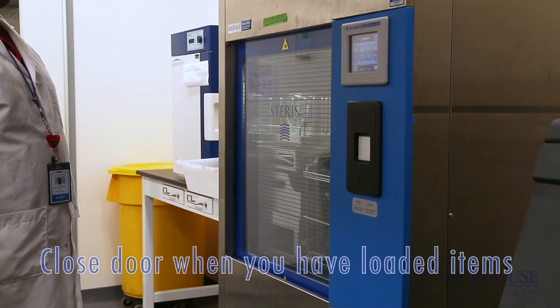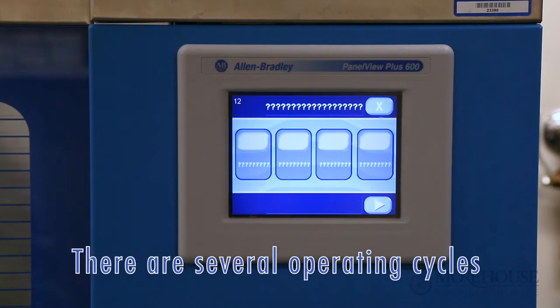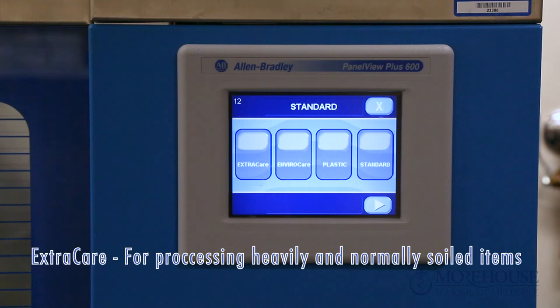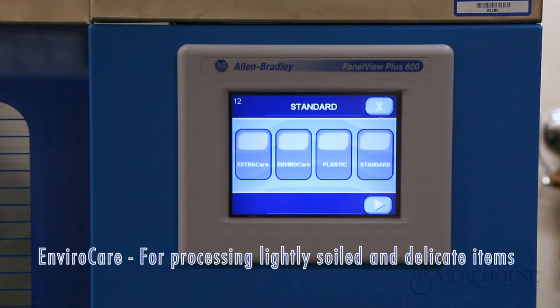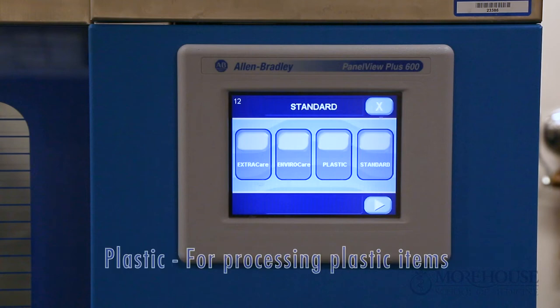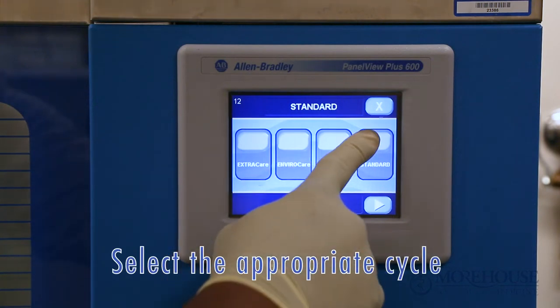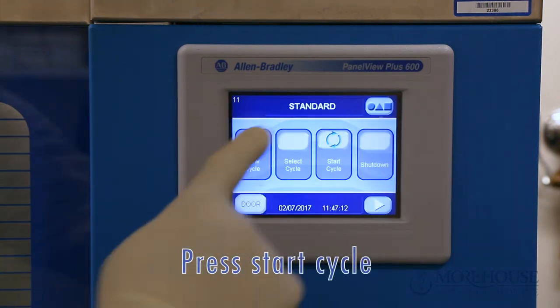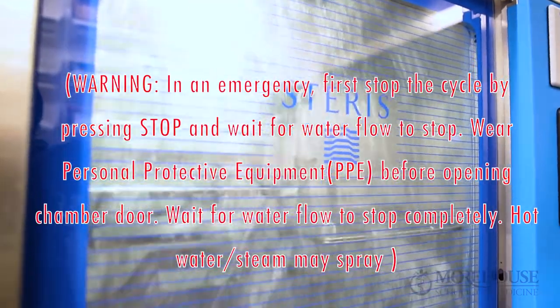Cycle selection: press View Cycle to review cycle details if needed. There are several operating cycles — Extra Care for processing heavily and normally soiled items, Envirocare for processing lightly soiled and delicate items, Plastic for processing plastic items, and Rinse Care for rinsing only. Select the appropriate cycle, then press Start Cycle.